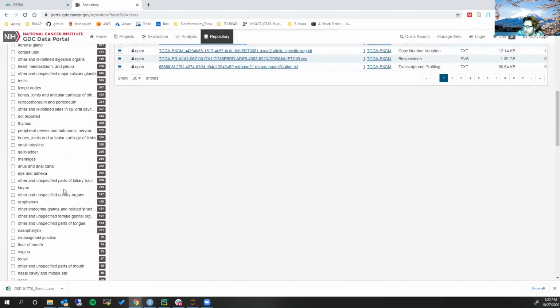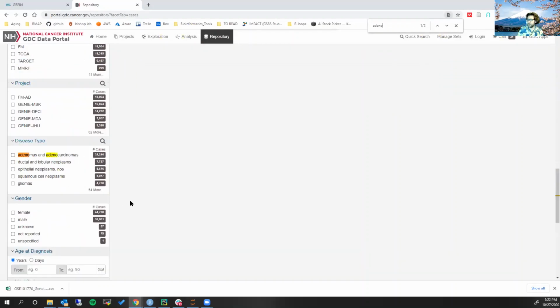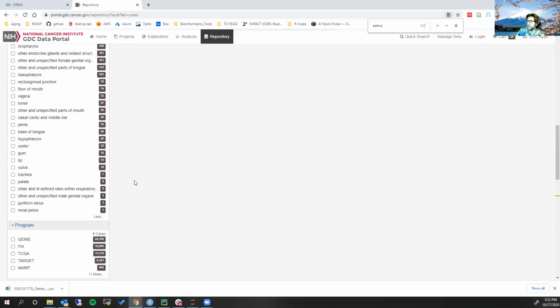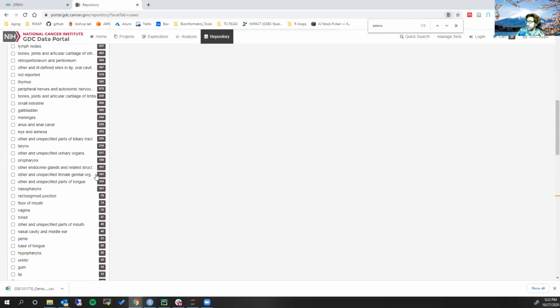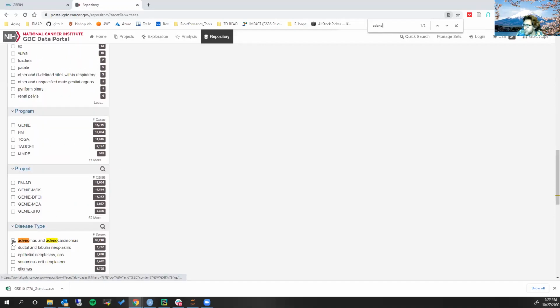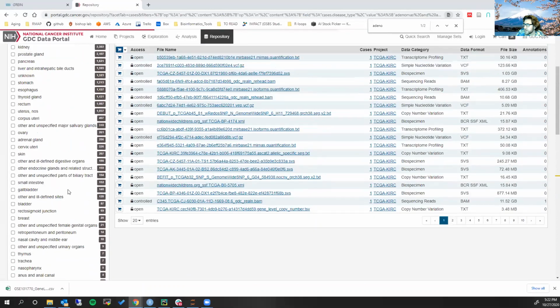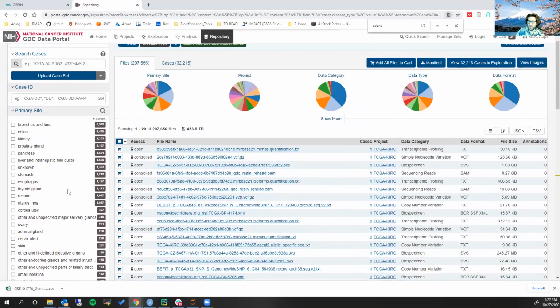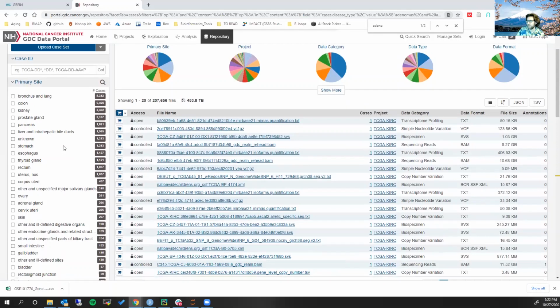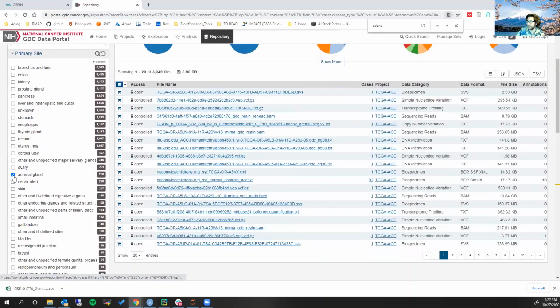So let's see if we can find that here. All right, well, apparently I don't remember where I got this from, so. Anyways, oh, yes, you're right, adrenocortical, yeah, okay. So this would be the adrenal gland then.